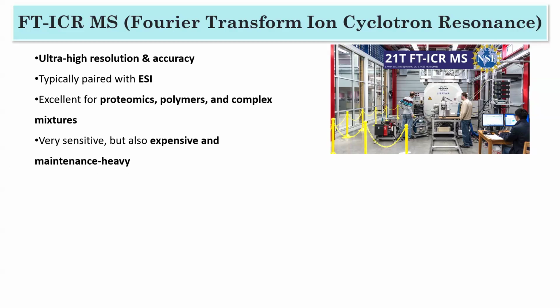Then another question is by Sneha. After the flight tube, what if we have the detector but no reflectron? In old TOF you don't have a reflectron, so you don't have good resolution. If you use the reflectron, it will help adjust the kinetic energy of similar molecular ions, and then you can get better resolution.